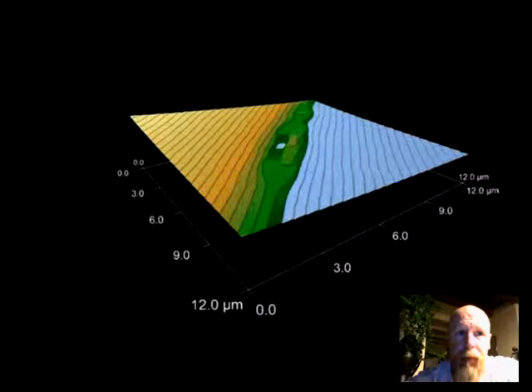Basically, AFMs just don't work by cantilever and probe alone, and definitely need support equipment. Most important is probably the piezo scanner, which actually moves the sample to be scanned across a cantilever or probe. A stage is also necessary, as it includes a stepper, motor-driven Z-axis stage. It houses the scanner, cantilever, and probe, and includes a precision XY axis stage as well. A video optical microscope is necessary to capture the image of the sample being scanned.